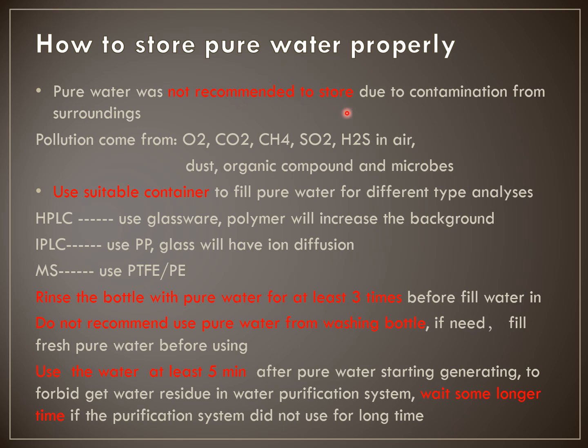Any component in the surroundings will contaminate the water, like oxygen, carbon dioxide, and other things in the air, and the organic compounds and microbes in the surroundings will contaminate your water in a very short time, maybe hours. Within hours, the water quality will change and no longer fit your requirement.